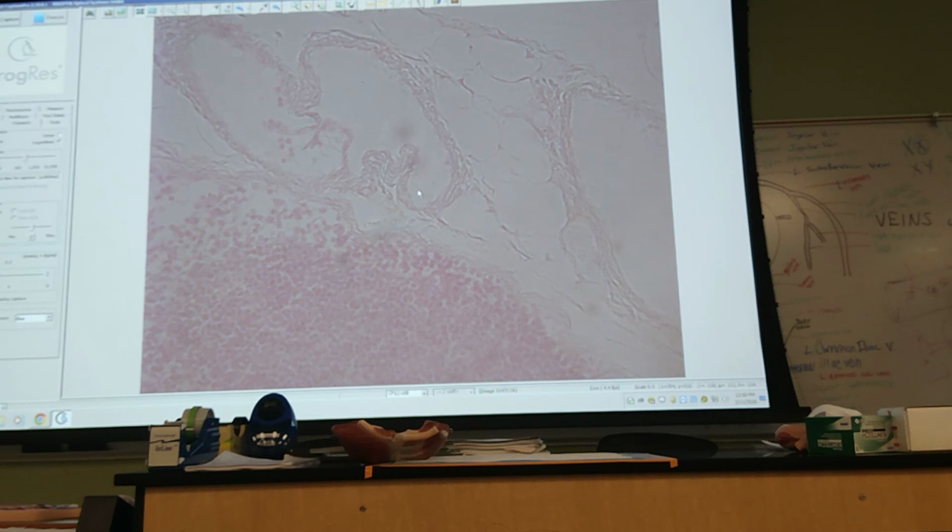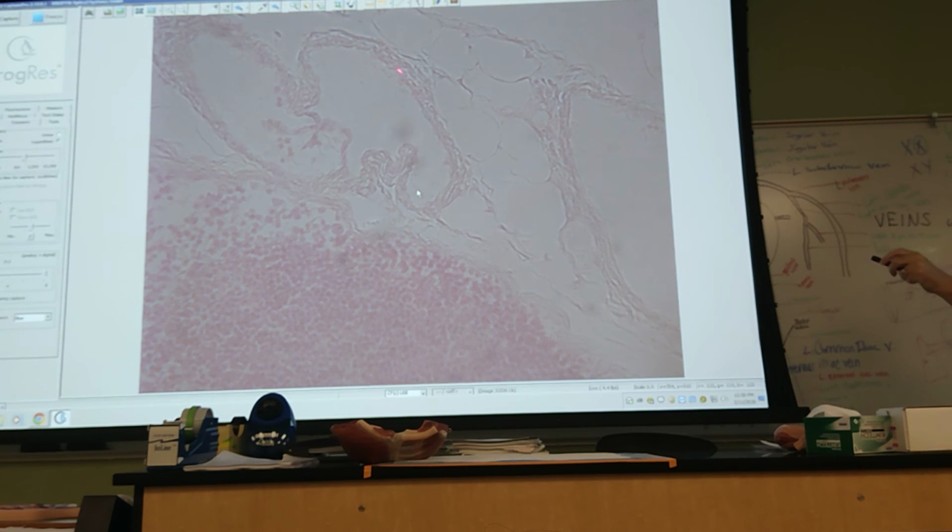All right. Here's a lymphatic vessel. Here's another lymphatic vessel. Almost looks like a heart, but it's one vessel. Here it is. Simple wall. Looks like that. And a valve is an inward extension of the wall. And it looks like a little thread. It connects to the wall on each side. So here's the wall.